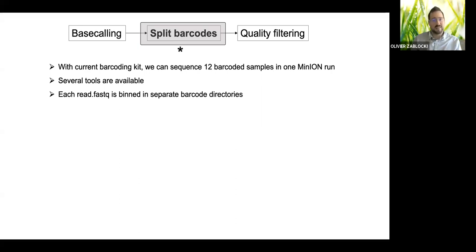There's still mistakes in those reads. And if you happen to have a mistake in the barcode region of the molecule, then you might have some problems. So this is a problem that has largely been solved. In the beginning, it was kind of an issue. But this is why there were also several tools that try to do this as accurately as possible.